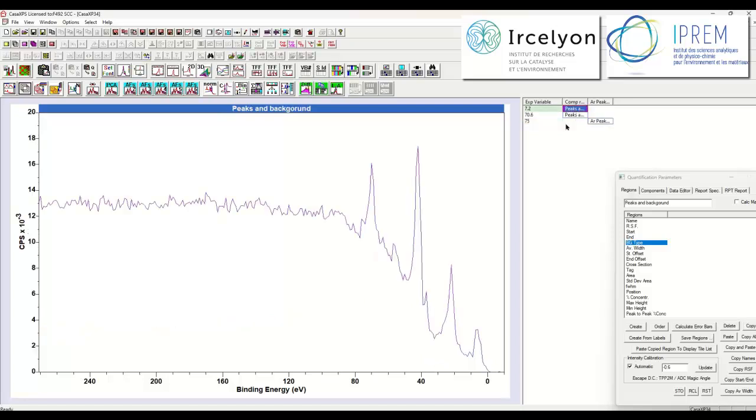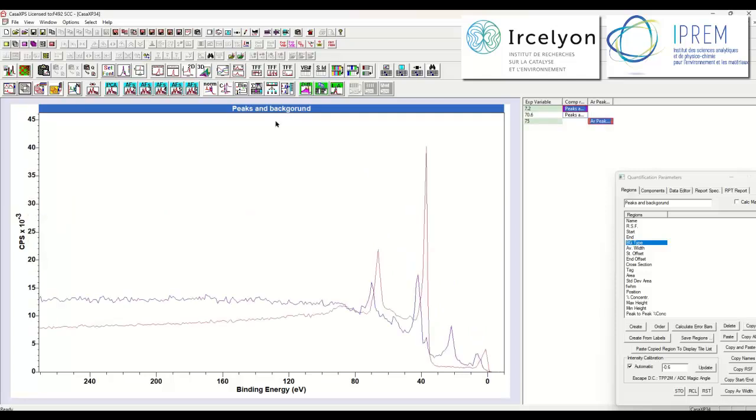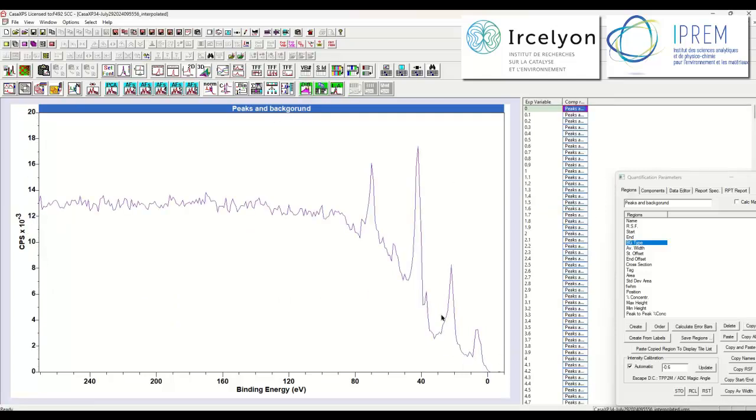For example, I see a bit of metallic signal here, even in the example of what ought to be at the surface. So I can subtract, using the difference approach, the metallic peak. So I could argue about which one I choose, but I'm going to choose this one as being an example of what's at the surface once I get rid of the metallic substrate signal.